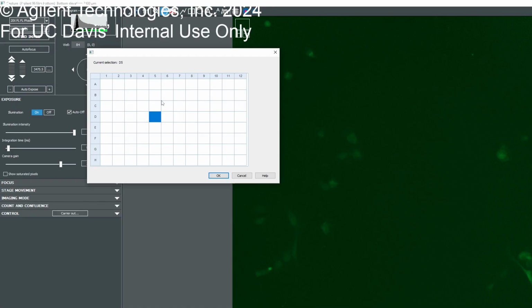So the other question, it takes a mean of all your auto exposure levels? Yeah. Got it. Yeah, okay. So we don't want to spend much time just waiting for the auto exposure. Got it. Okay. I always encourage you guys to use the manual exposure if you can. And I can also show you when we get to the experiment stage how easy that is.